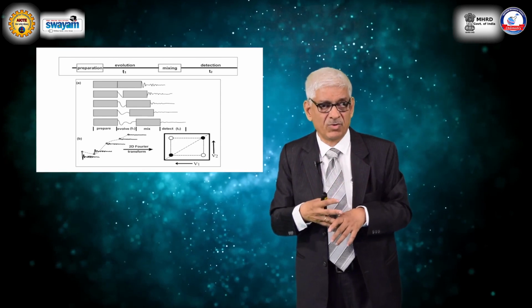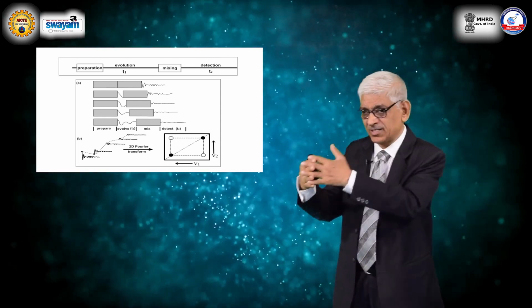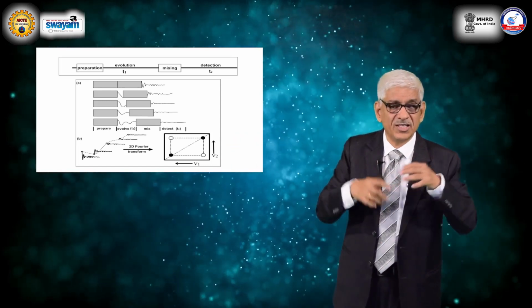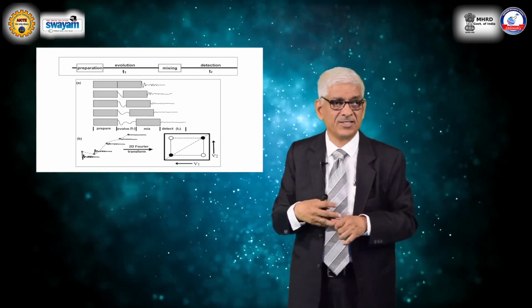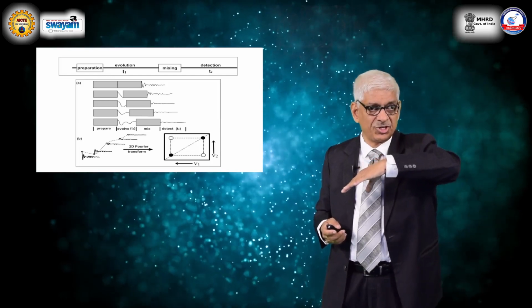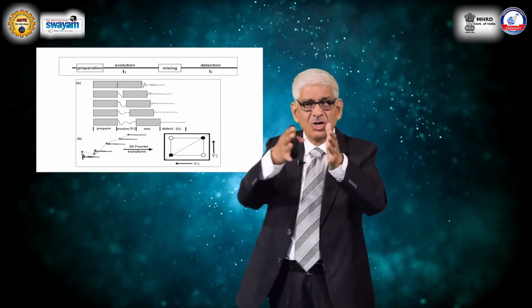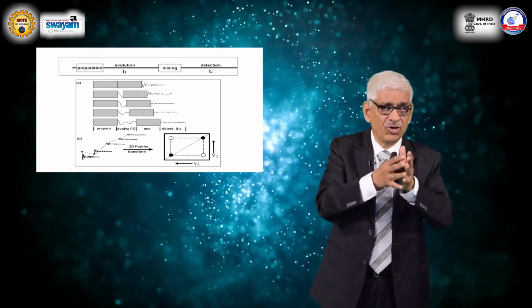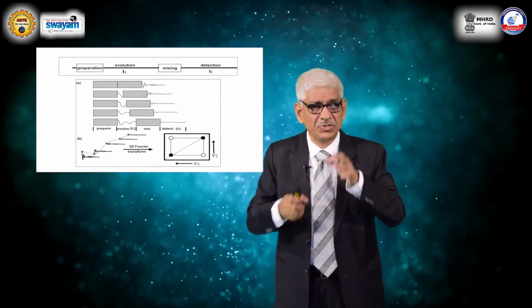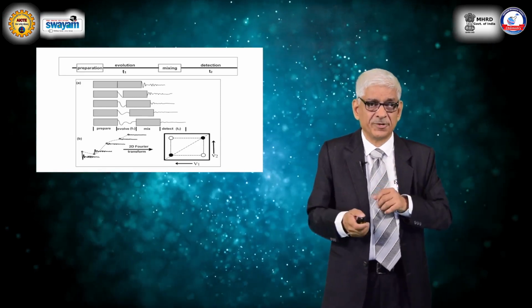Now, the Fourier transform NMR had another important development, and that is that excitation of your spin system and the detection of the signal are separated in time. This is called the segmentation of the time axis. You excite your spin system by applying an RF which rotates the magnetization, and when you are collecting the data as an FID, you are not doing anything. Okay? Therefore, the excitation and the detection are separated in time, which means that you can do various other kinds of manipulations in between.